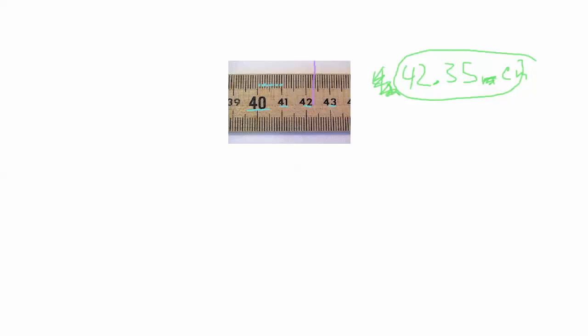Let's do one more. Let's say we had one that was right here, pretty much right on this line right here. All right. So we've got 43 is this line, 0.1, 0.2 it looks like. So that would be 43.2.